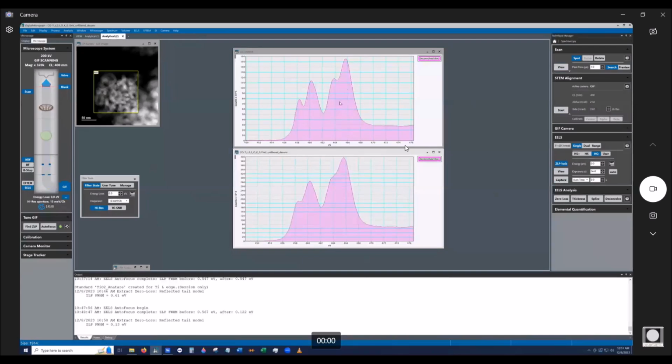And again, we can do much higher energy resolution than this, to be sure. This is, again, partly the dispersion used, which I didn't need the super high dispersion one to show what I needed to show anyway. So just enough to show better separation for the splitting here, right? So this is the L3 versus the L2 peak. You can see the separation here much better with the filtered versus the unfiltered.